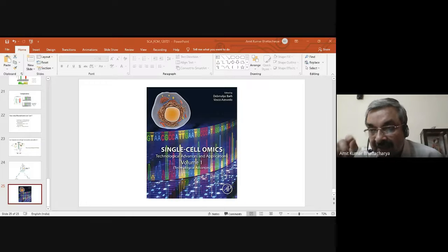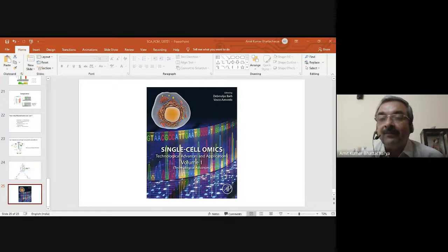If it detects that there is autofluorescence there, it subtracts it from that pixel. So the algorithm knows the total profile of the autofluorescence, because there's a library, and it looks at the entire image point by point.